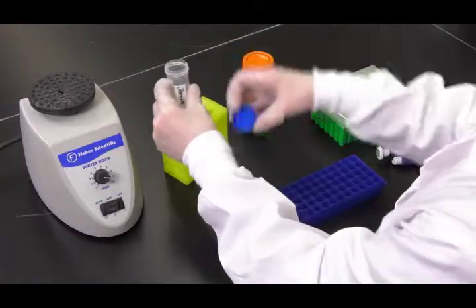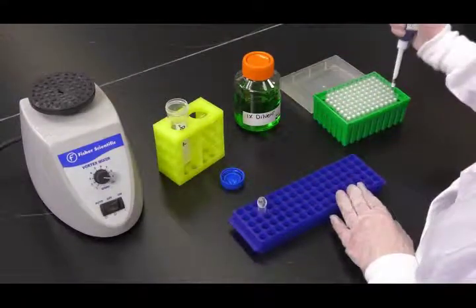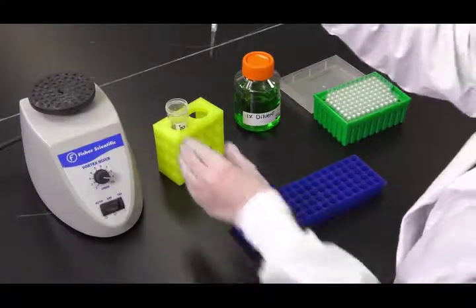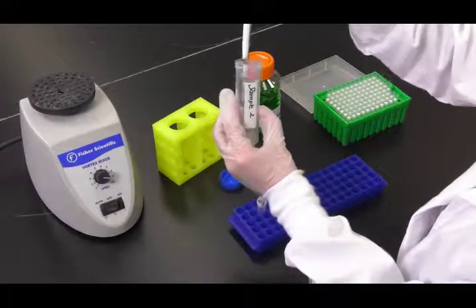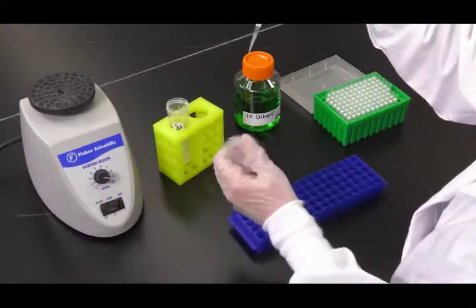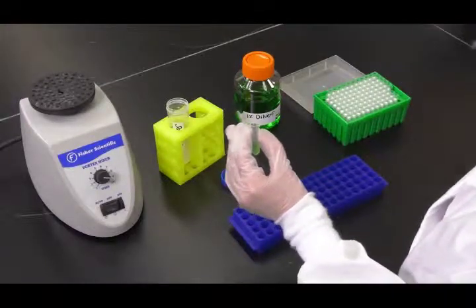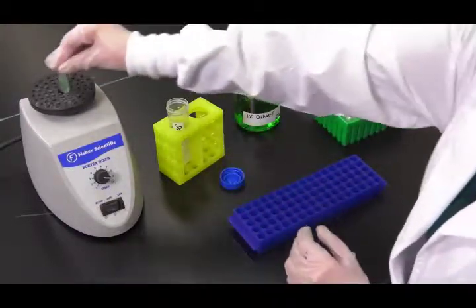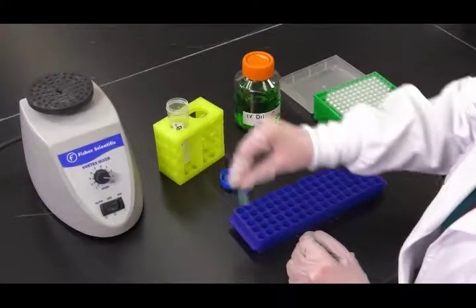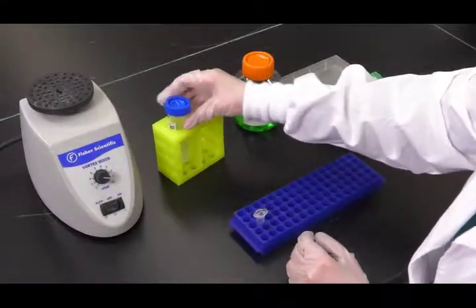After incubation, centrifuge the samples at 3000 XG for 20 to 30 seconds to pellet particulates or allow them to settle for 5 minutes in a test tube rack. Finally, collect 100 microliters from the middle aqueous layer and add it to 900 microliters of the 3M diluent solution and vortex or shake to mix well.